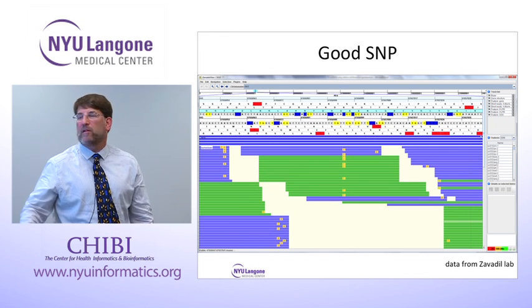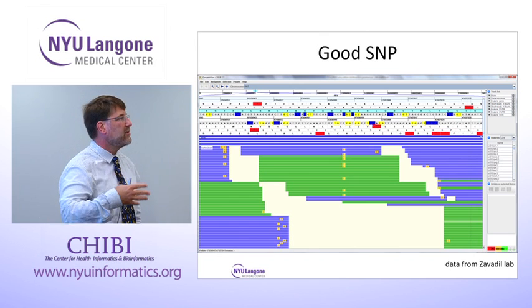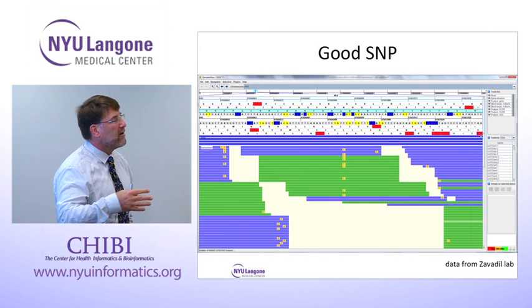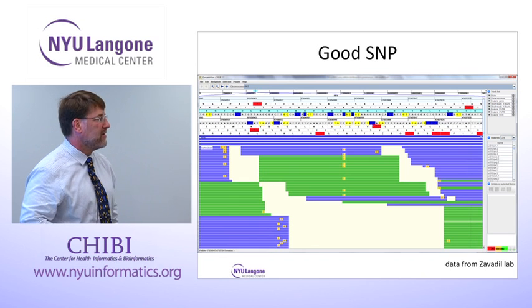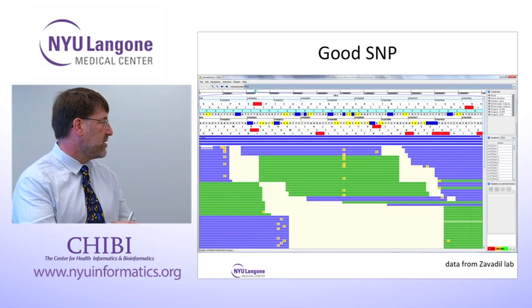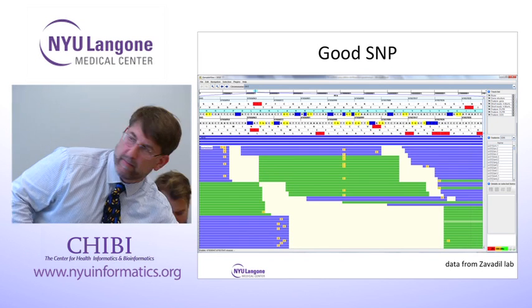So your cutoff to be interesting is something that's statistically close to 50%. You might set your cutoff at 30% as being entirely reasonable. Now, of course, if there's differential allele expression, 20% might be real, 10% might be real. It depends on how you set up your software. Those are parameters that you can play with depending on your expectations.